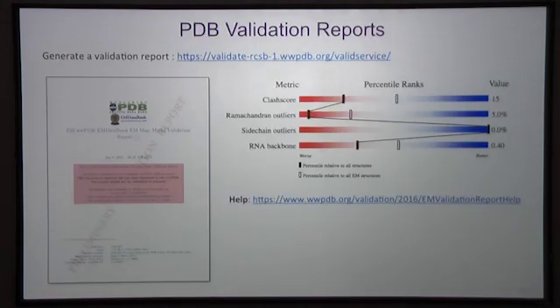And then the PDB also, before you deposit your model, will perform some validation calculations. It will give you tables of statistics. It will analyze every single residue in your model, and it will compare your model to all other structures and to all other EM structures. So you can see whether what you're doing is as good as what other people are capable of doing.